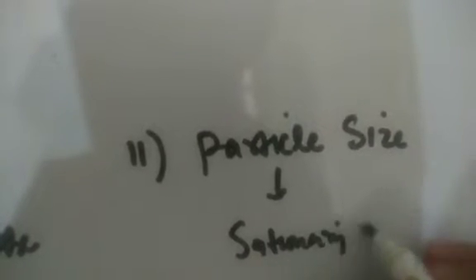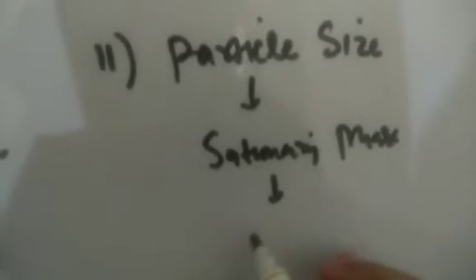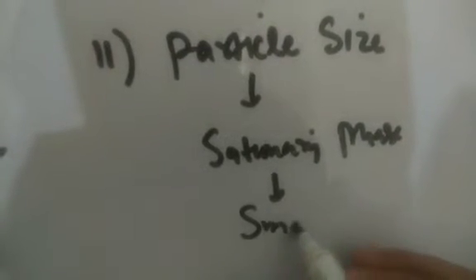So in HPLC, the particle size of the adsorbent, or the stationary phase, is smaller.